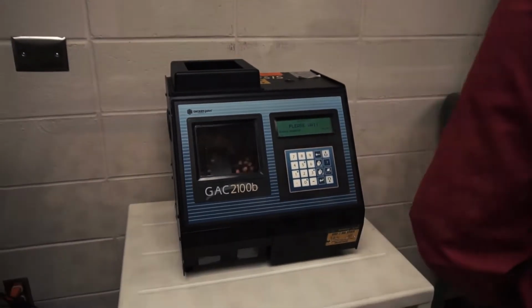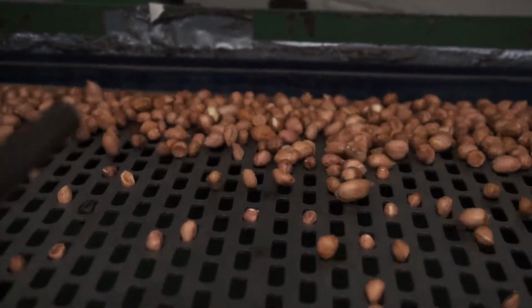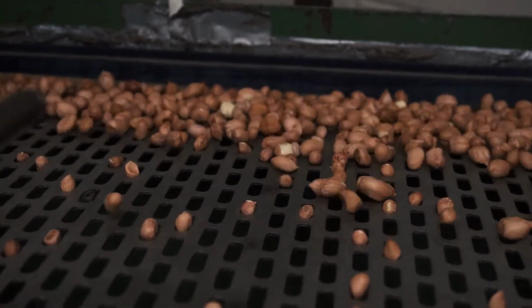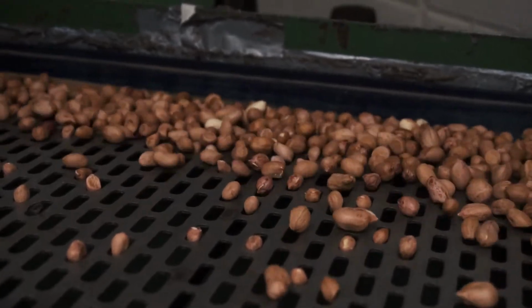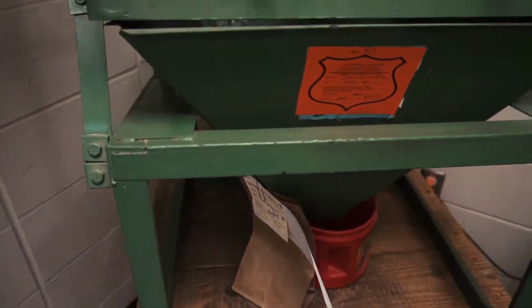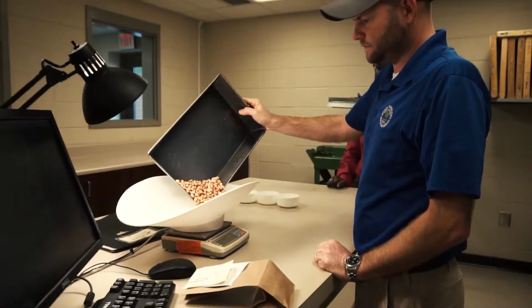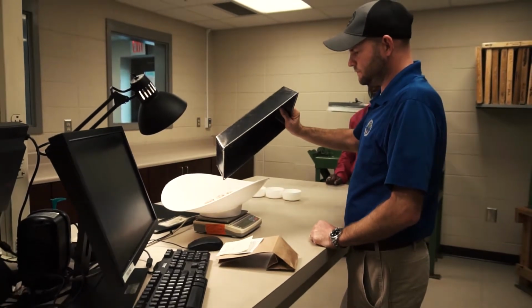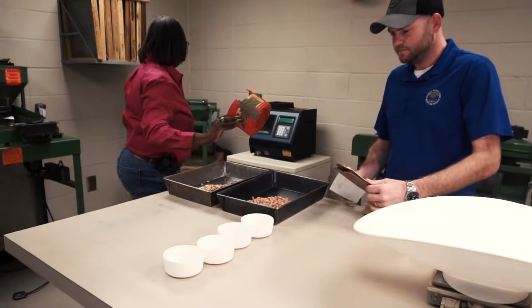From there, the peanuts are spread over the mechanical shaker screen with 16/64 by 3/4 inch diameter slots. The peanuts and peanut pieces that fall through the screen are collected separately from the peanuts which did not fall through the slots. Any split kernels that rode the screen are removed, and the whole kernels are weighed and recorded. The visibly damaged kernels are removed from the damage-free or sound mature kernels, SMK.